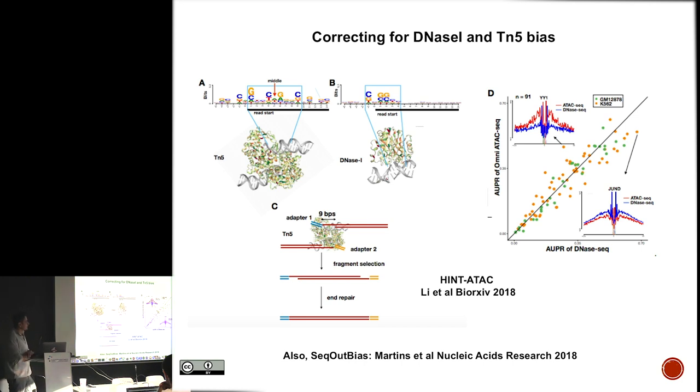Yeah. So Gordon showed in some Molecular Cell papers that AP1 transcription factors have very weak footprints because they have a higher on-off rate. Whereas factors like CTCF, which have a really long motif, have a long residency time. So they sit on DNA longer, so their footprints tend to be more robust. You also have to remember that these footprints are an aggregate across all of the cells, right? So if you measure 50,000 cells, you're actually looking at the potential footprints from all 50,000 cells in aggregate, or all sites in aggregate, right? So being able to look at footprints within smaller numbers of cells may be a difficult thing to do, right? So you may have to rely on additional information like ChIP-seq or motif, or things that aren't available yet.